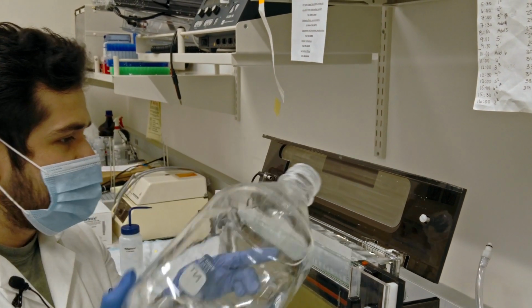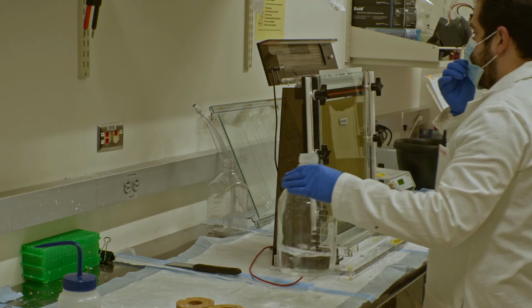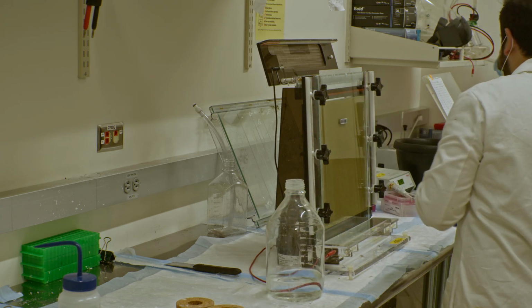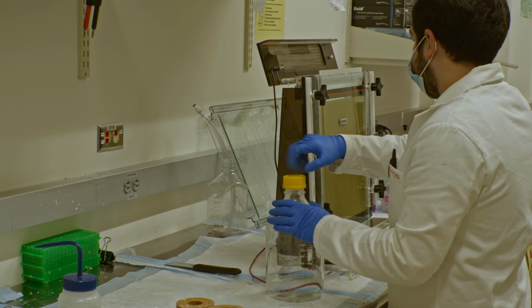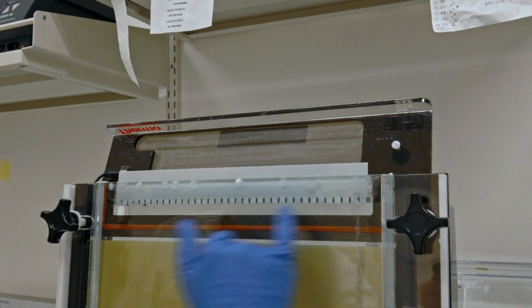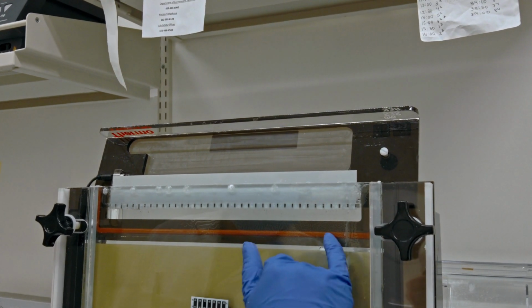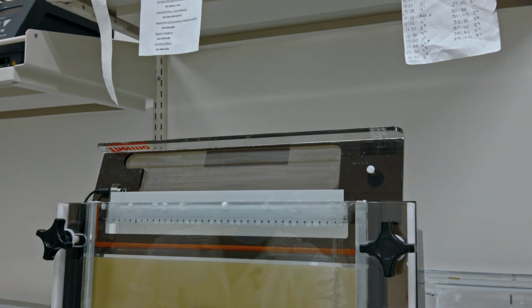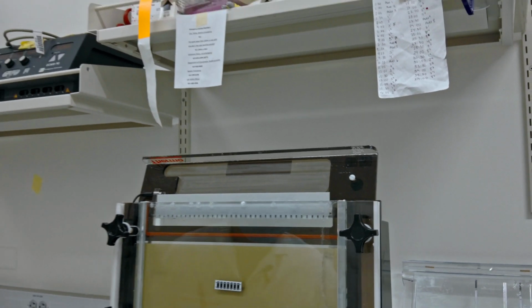All right, that should be enough. As long as you have enough TBE over the wells, that's great. That's all you need. And as you can see, not only is there enough TBE above the wells, but there's also no leakage of TBE into the back part of the aluminum casing. So in other words, everywhere along this gel, it's perfectly tight, so we don't need to tighten it anymore.